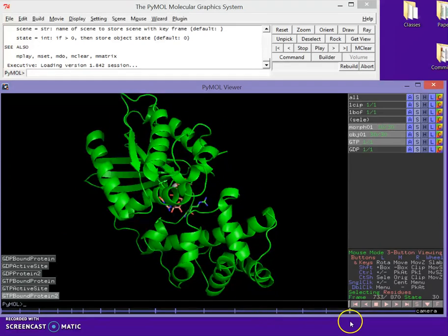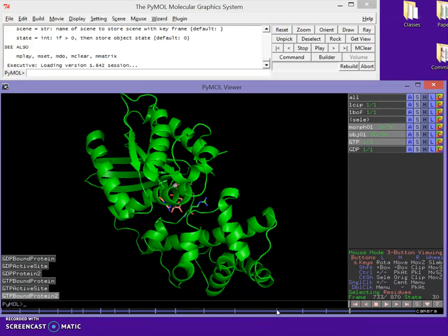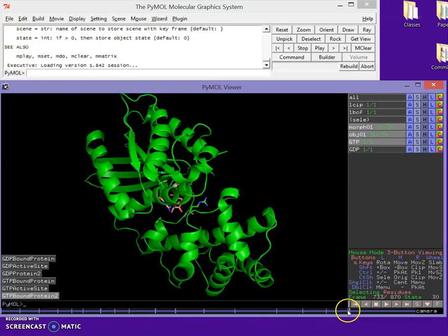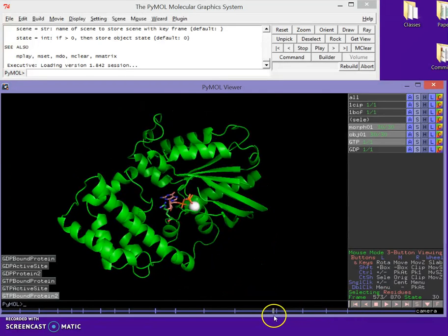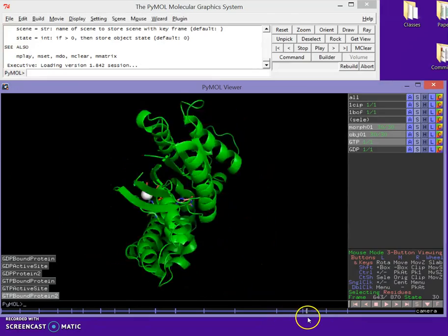And let's go back all the way around to this point. So I'm just going to copy this one, right-click, shift, hold, to down here. So that should give us a full spin.